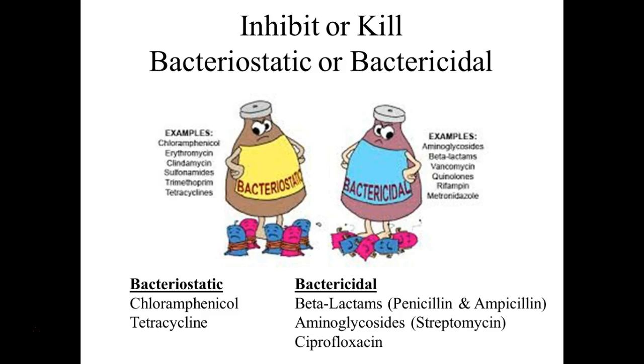Okay, so bacterial static, they just slow them down. So you notice they got them tied up, right? Bactericidal, on the other hand, and of course we're being very specific here in talking about affecting only bacteria, this will actually kill. So some examples of the antibiotics that we have on the plates that we use today for bacterial static are chloramphenicol and tetracycline.